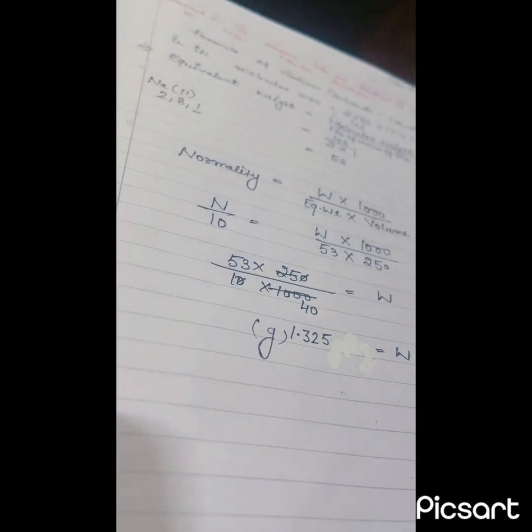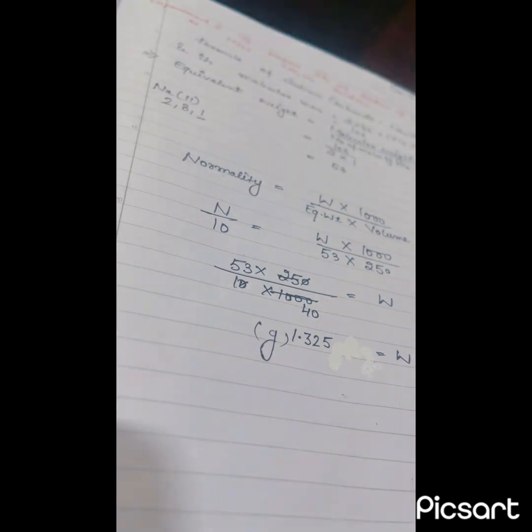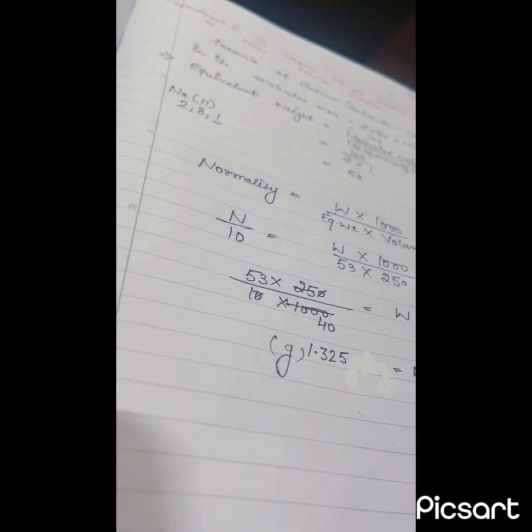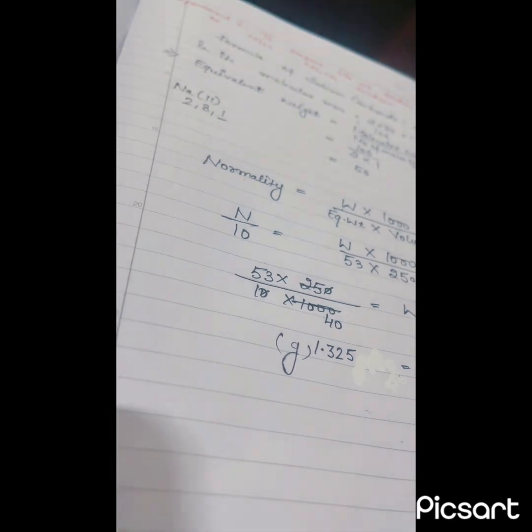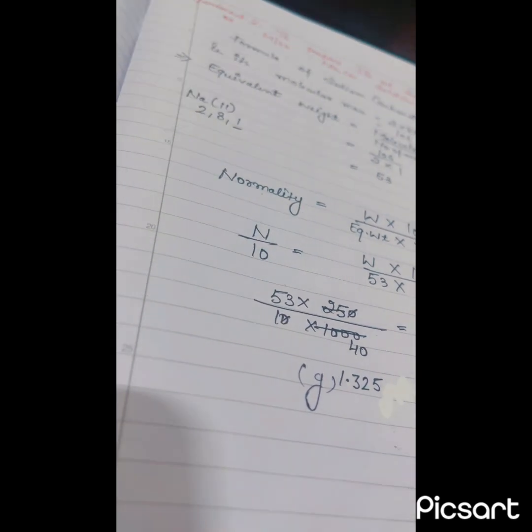From that value of sodium carbonate, we can understand that 1.325 grams of sodium carbonate is added in 250 ml solution with the continuously stirring. Now our N by 10 normality or M by 20 molarity is prepared.